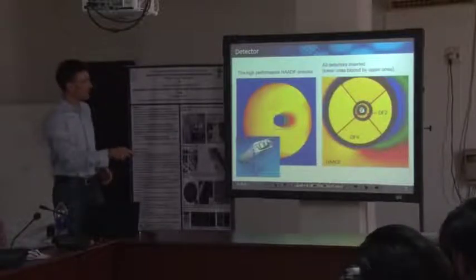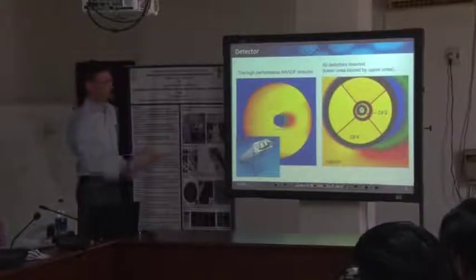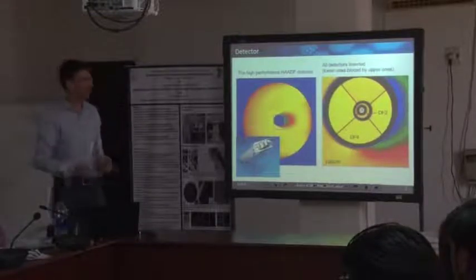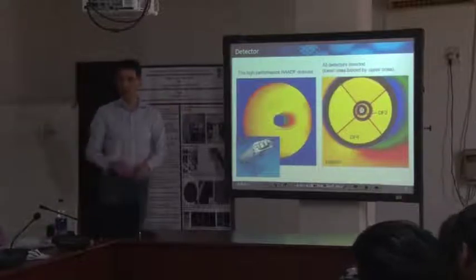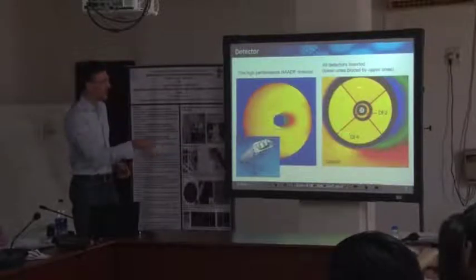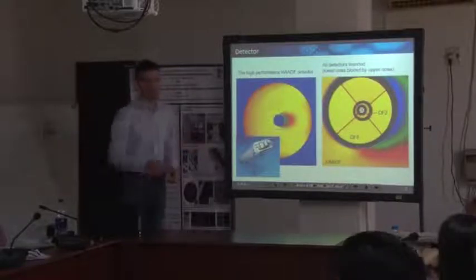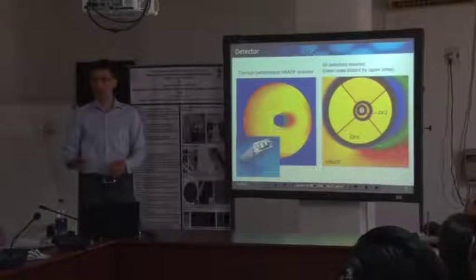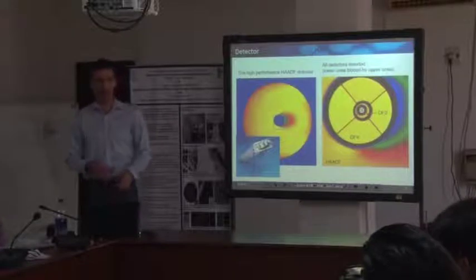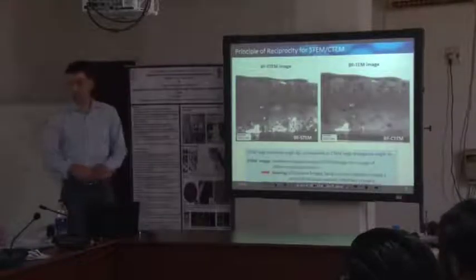Here are several detectors inserted in the microscope. They just sit at different depths of the microscope. They are either inserted from one mechanical drive, or you might have several drives to insert those detectors. This is bright field, an annular dark field, and a high angle annular dark field. In this particular case, the high angle dark field detector is even segmented. This is for very special techniques where your electron beam is deflected, for instance, due to electrical fields within the sample. Nowadays we can measure electrical and magnetic fields down to the atomic scale. So this is a very elaborate technique already.